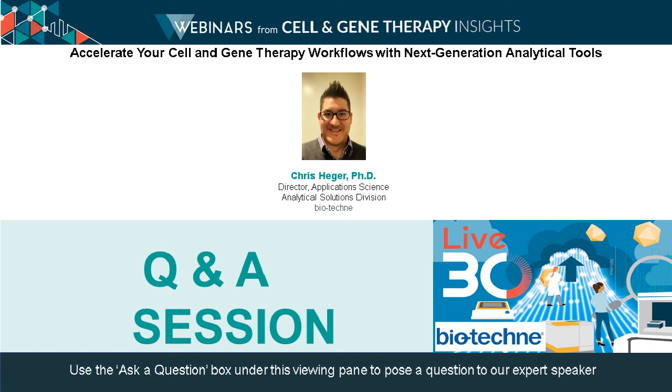Yeah, we have an antibody database on our website that has, I think, nearly 3,000 antibodies that have been verified to work on Simple Western. With respect to the antibodies I described today, the AAV viral protein antibodies from ProGen are listed on our website as well with the working dilutions, and the anti-DNA antibody that I described here is in the application note and will also be available on the website. And just to add, the anti-DNA antibody is a product from Bio-Techne.